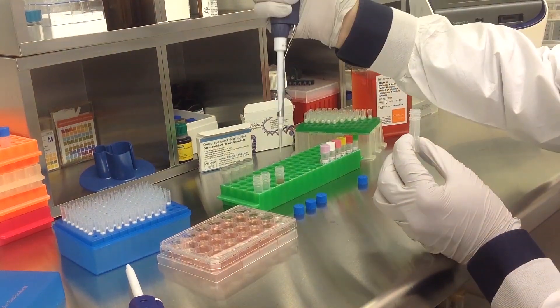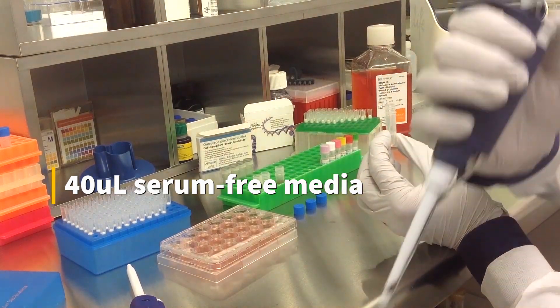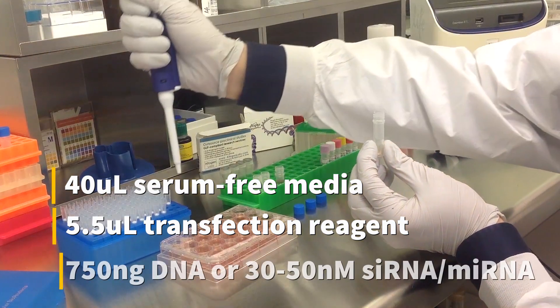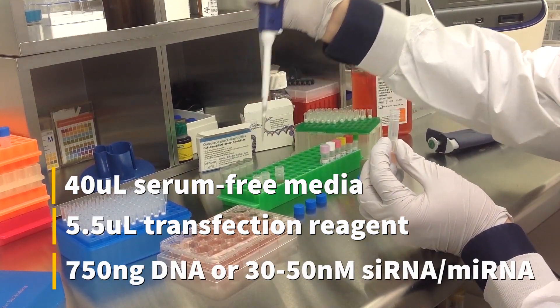To prepare the transfection complex, mix 40 microliters of serum-free medium, 5.5 microliters of transfection reagent, and either 750 nanograms of DNA or 30 to 50 nanomolar sRNA or microRNA.